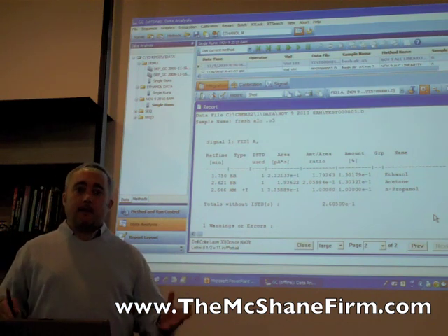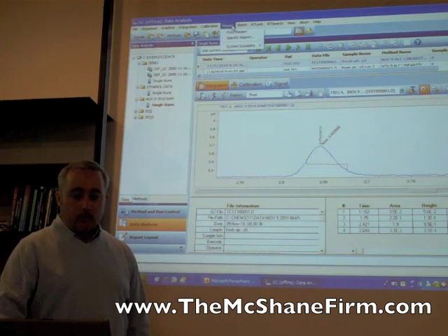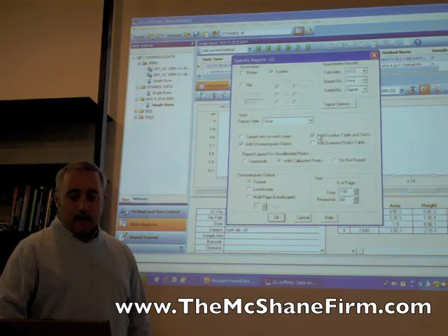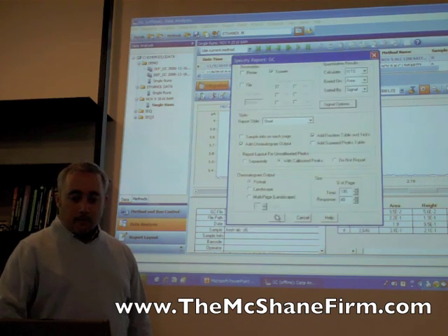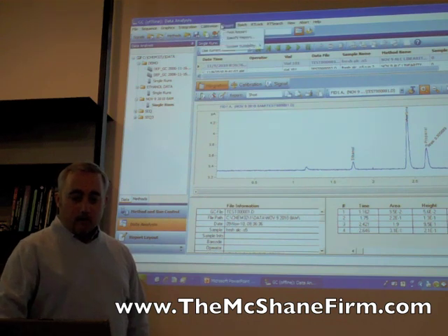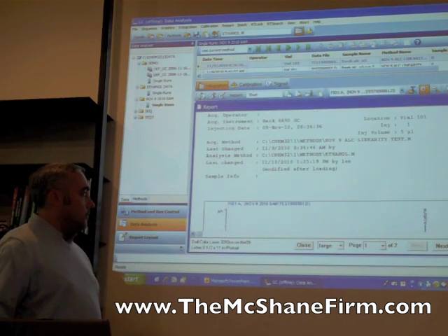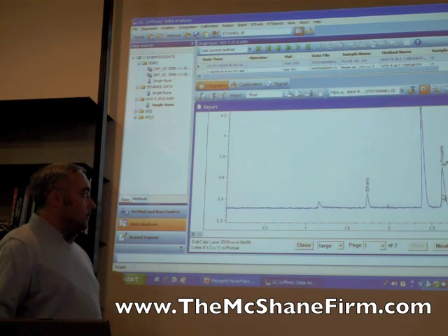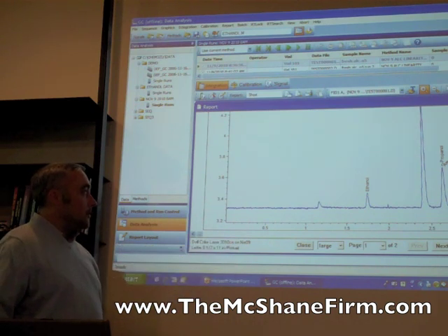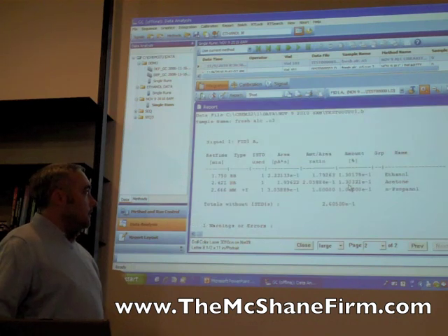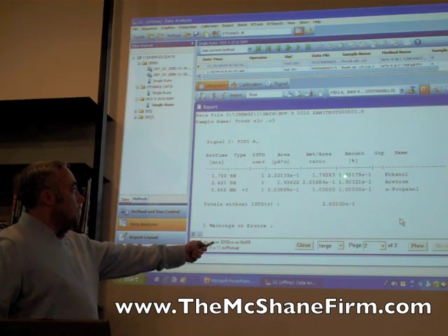You might say: as long as those two telltale signs are there, I can catch manipulation. But I can make those two things disappear. The first is really easy — go into Report, Specify Report, then Signal Options, and tell it to remove the tick mark and the baselines. Without those, you won't be able to tell on the printed chromatogram whether someone manually integrated the area. When we print it, you see no baseline — even though we drew it — but you still have that telltale sideways mark. The result still shows 0.13.